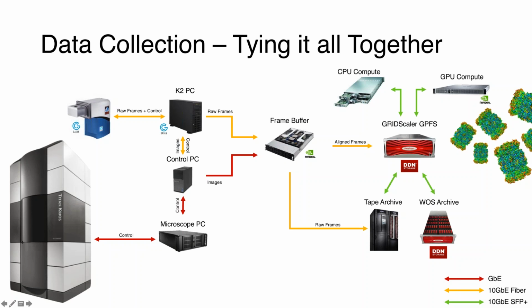Most of our archival is done on tape, and I don't want to say infinite, but I don't have a hard size on that because as we fill up the tapes, we just buy more tapes. I would say that most of the footprint of modern cryo-EM processing, post UCSF motion correction, where the alignment and dose weighting is done in the frame alignment, is cold.